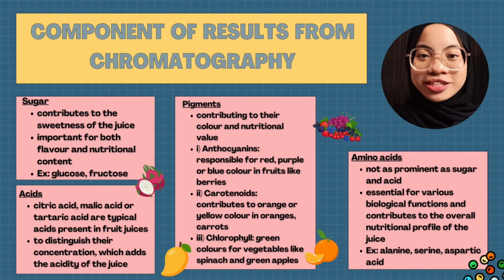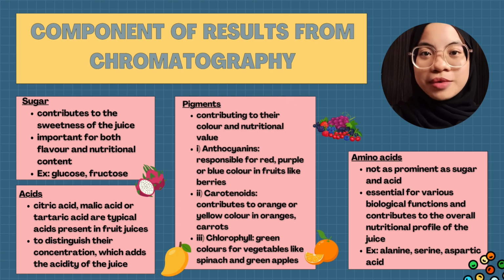Hi, my name is NUWAIRAH, and I will be explaining the example of results that will be obtained from the chromatography. But before that, let me first explain the components that will be revealed from the chromatography process.